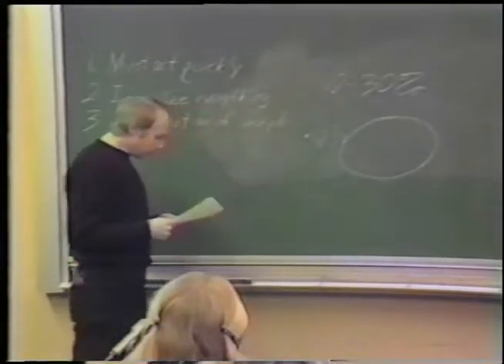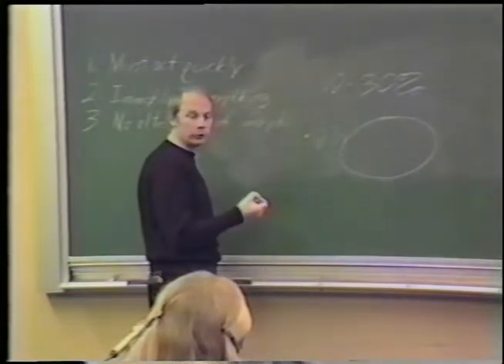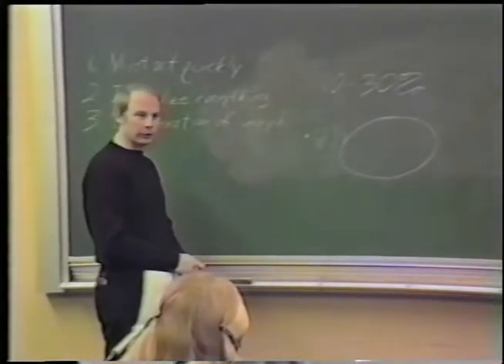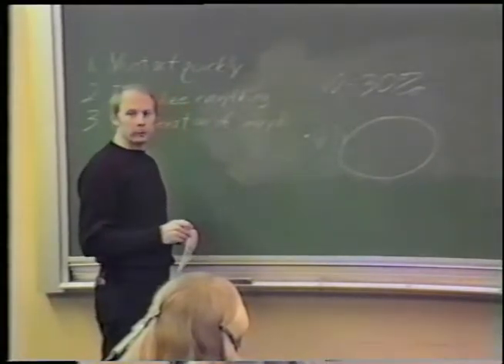Now, these non-penetrating cryoprotectants are not without their faults. They can cause cell shrinkage through colligative or usually non-colligative osmotic pressure effects. And this can lead to its own set of artifacts, concentration of solutes, etc. And they also are not all physiologically inert.